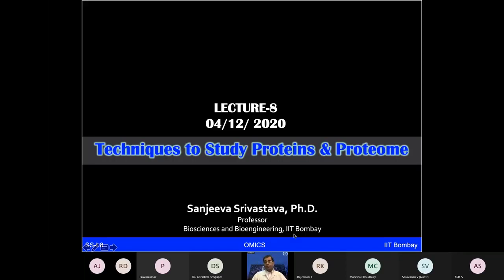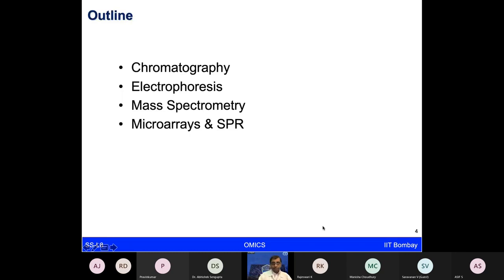But then we'll also take you to some of the more complex and newer versions of the instruments, especially different types of array-based platforms or different types of mass spectrometry platforms, and how they can be used for generating big omic data sets. And of course, only by having a mixture of the classical as well as the more high throughput technology, you can do a variety of research.